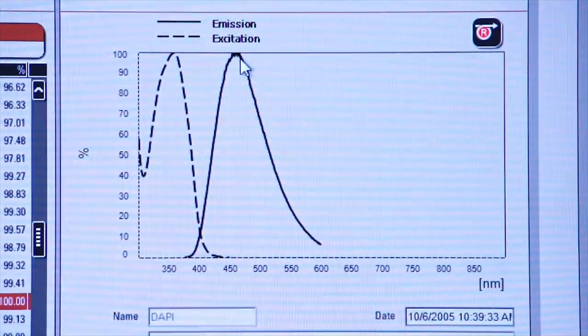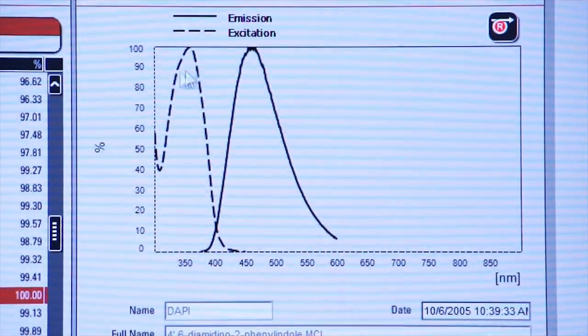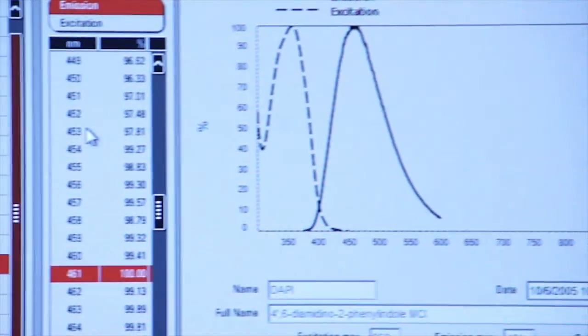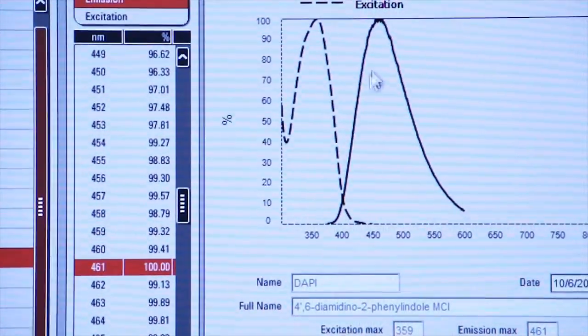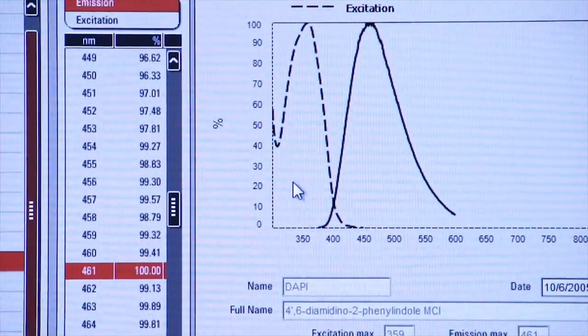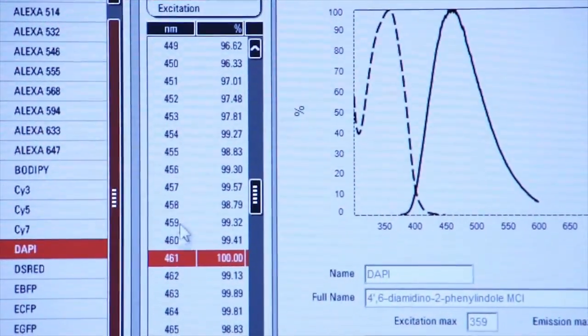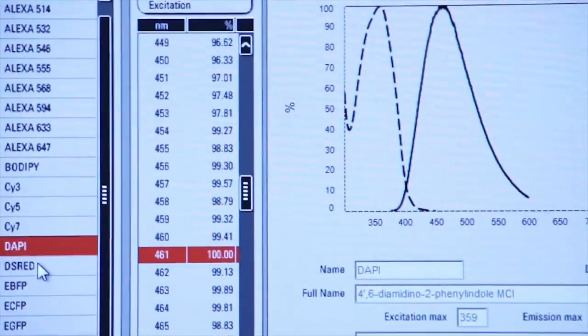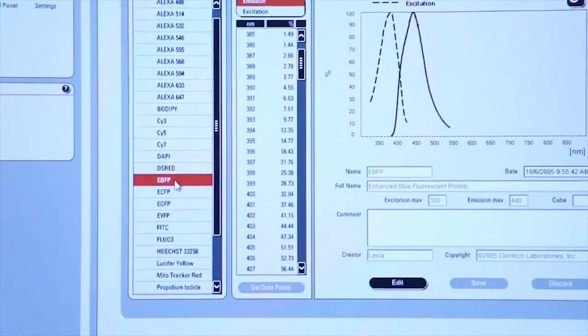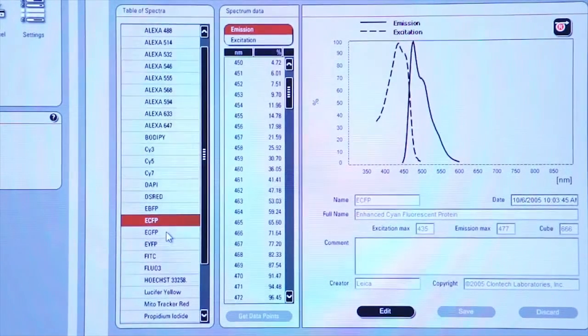So we know the excitation wavelengths and the emission wavelengths for this particular fluorophore. This is a very useful reference tool to be able to study the different dyes that you might be interested in and what their excitation and emission wavelengths might be.